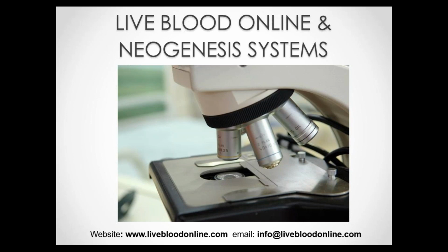So live blood analysis creates an interactive and interesting dynamic in practice. Once the drop of blood has been taken from the client's finger and placed on a slide under the microscope, the sample is then viewed by the practitioner and the patient on the screen. So the practitioner discusses the various anomalies of the patient's blood in detail with them, highlighting the symptoms that may be experienced as a result of the anomaly, as well as the dietary and lifestyle factors that may have contributed, as well as the steps that need to be taken, of course, to correct the anomaly.